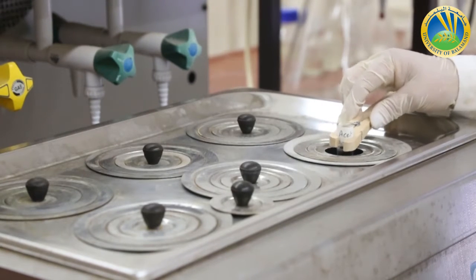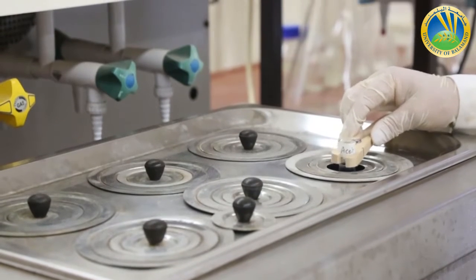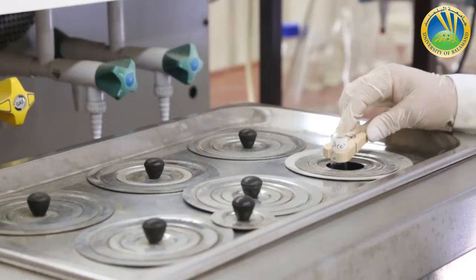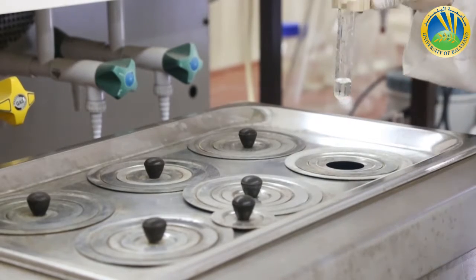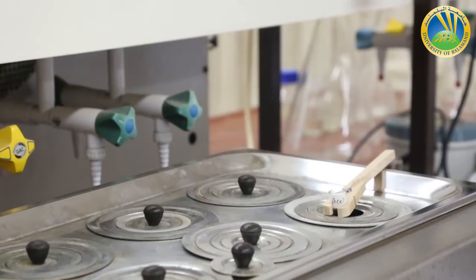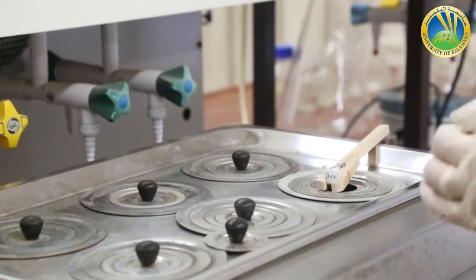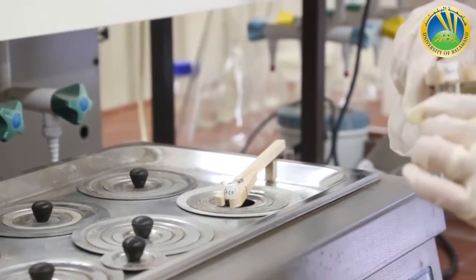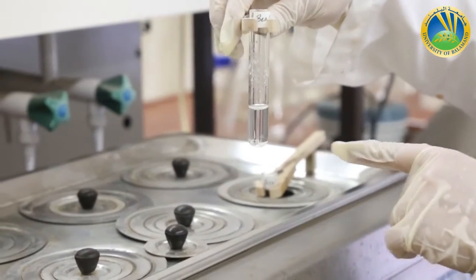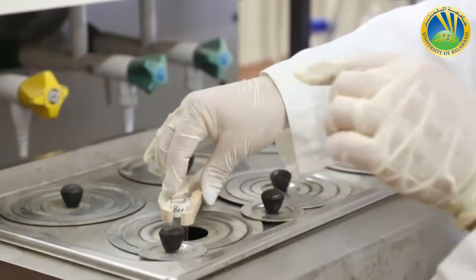Now I'm seeing that acetanilide is going to dissolve totally in hot water. So I will see that the acetanilide will totally dissolve in hot water. Let me check. Also, benzoic acid has to be tested inside hot water because it did not dissolve totally at room temperature. I will put it here like this.